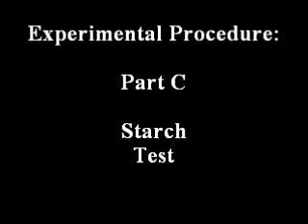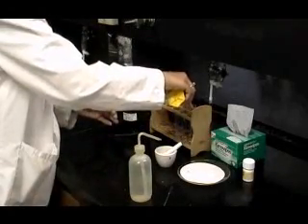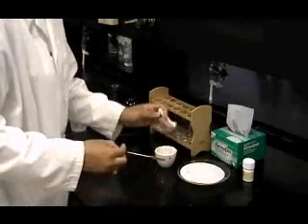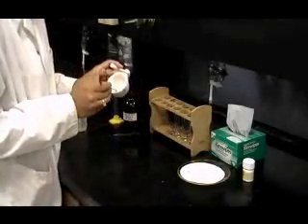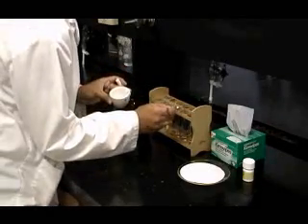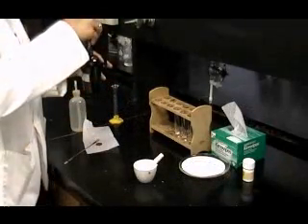The presence of starch can be identified by the starch iodine test. Begin by adding about 2 milliliters or 40 drops of deionized water to each of three 10-centimeter test tubes. To the first, add enough powdered commercial aspirin to just cover the bottom of the test tube. To the second, add a small amount of your synthesized aspirin. The third test tube will be left blank and is the control.